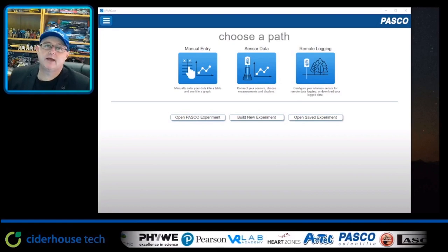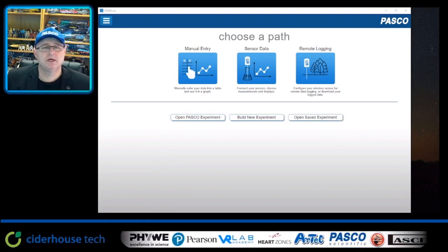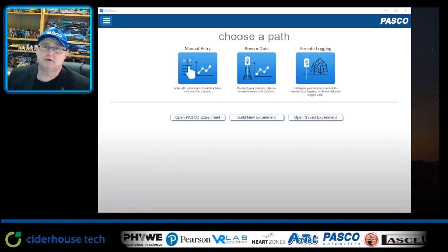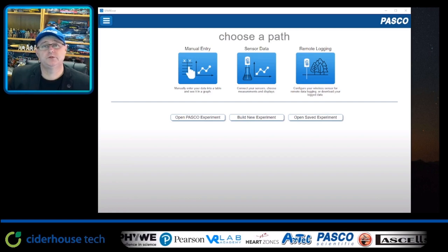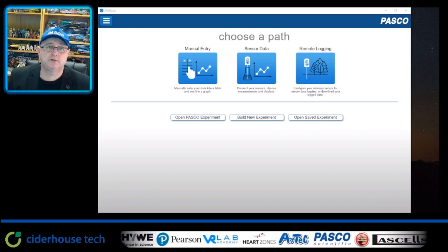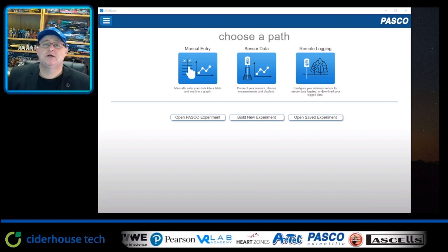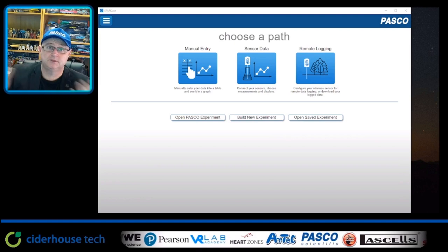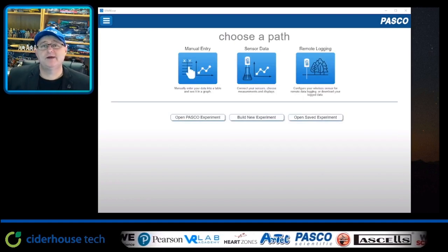Next thing I want to look at is adding manual data. For things where you don't have a sensor, this is a really cool feature. So if you wanted to, say, do a momentum prac, you could add your mass and use your motion sensor for your velocity. But in this instance, I want to show you using a titration. For those of you who don't have our new wireless drop counter, this is the perfect way to do it.